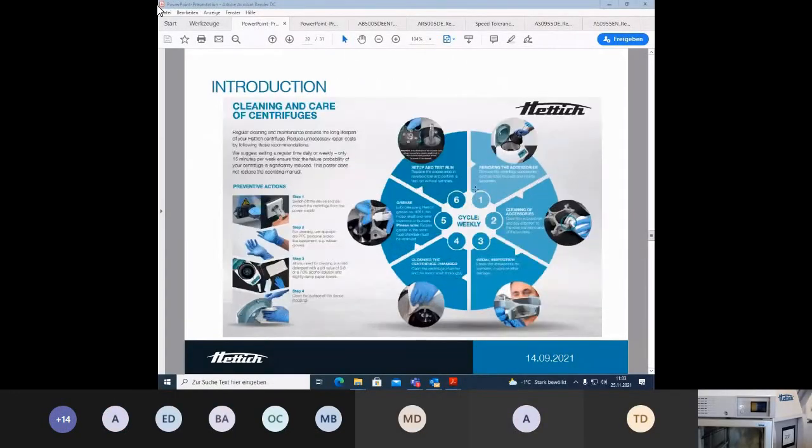So we have here an introduction for you and the customer. I shared a link in the chat. You can also watch the cleaning and the care of the centrifuges on YouTube.